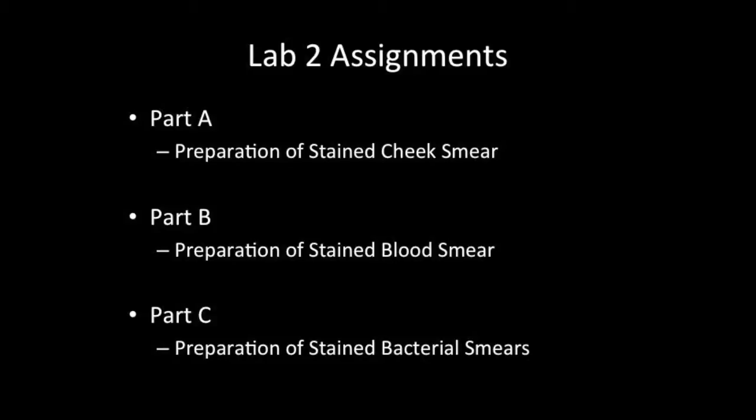In Part C, the last portion of this lab session, you will prepare 2 samples of stained bacteria. Again, use proper precautions and dispose of slides in the proper containers.